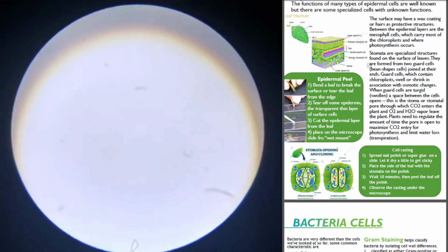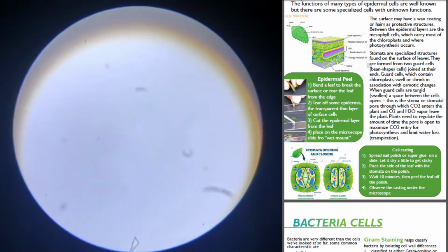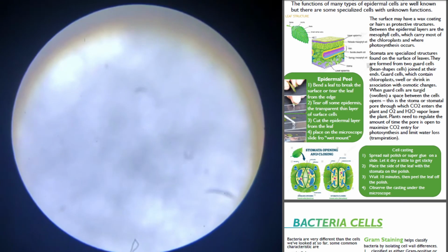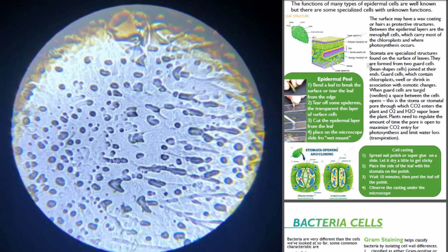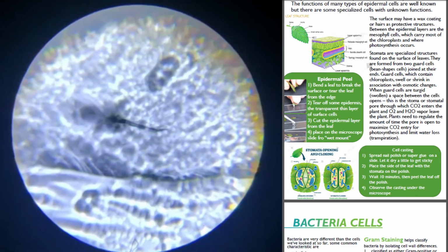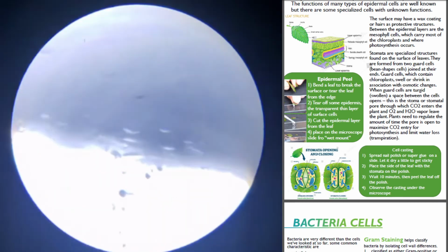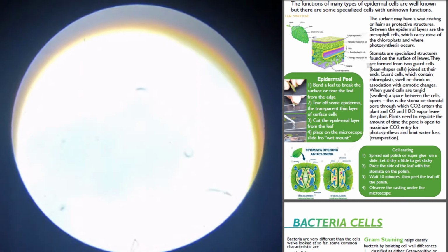Paintbrush to go up and down. There we are again. Find me some stomata. Finding it right now. Hello, stomata.